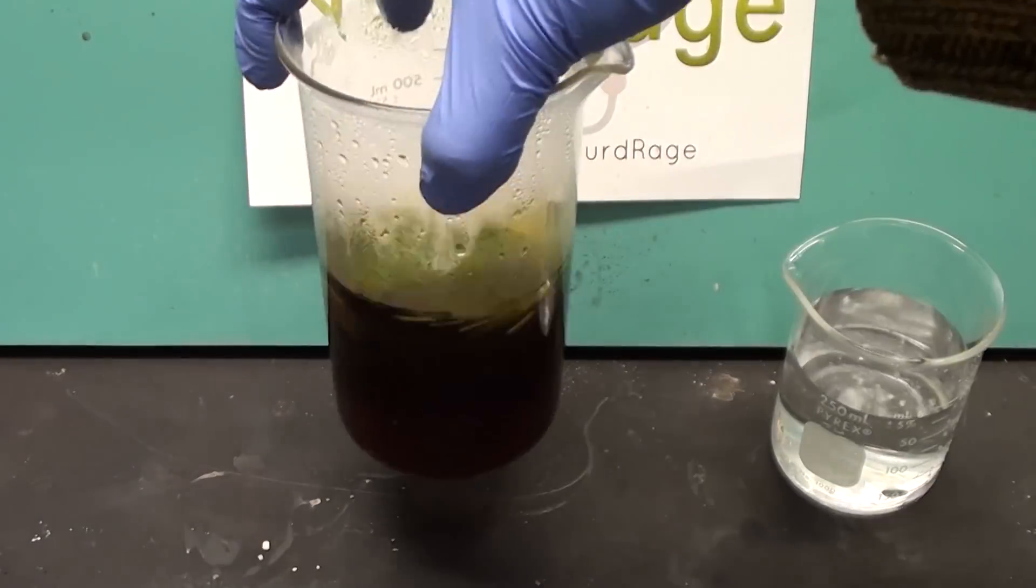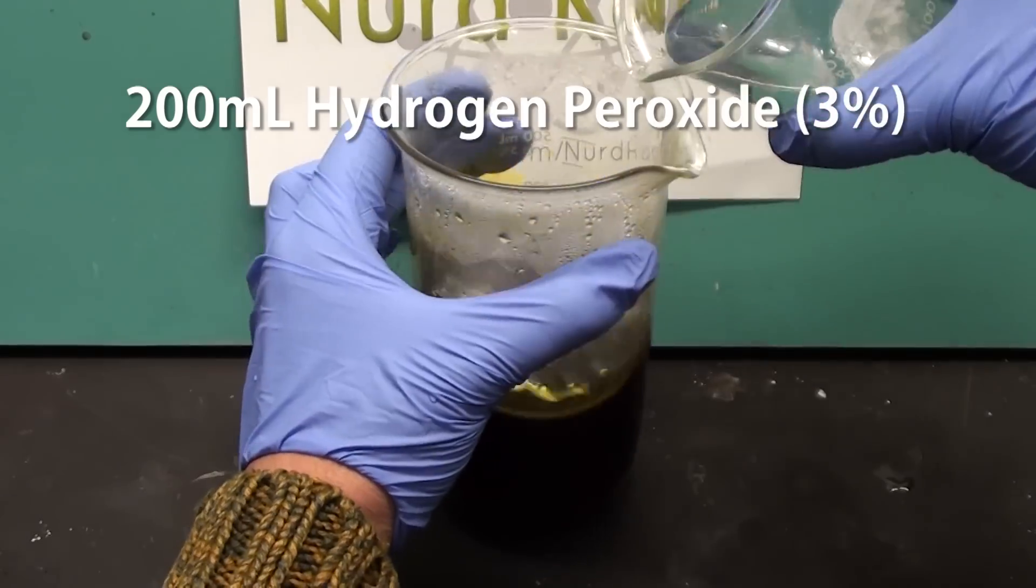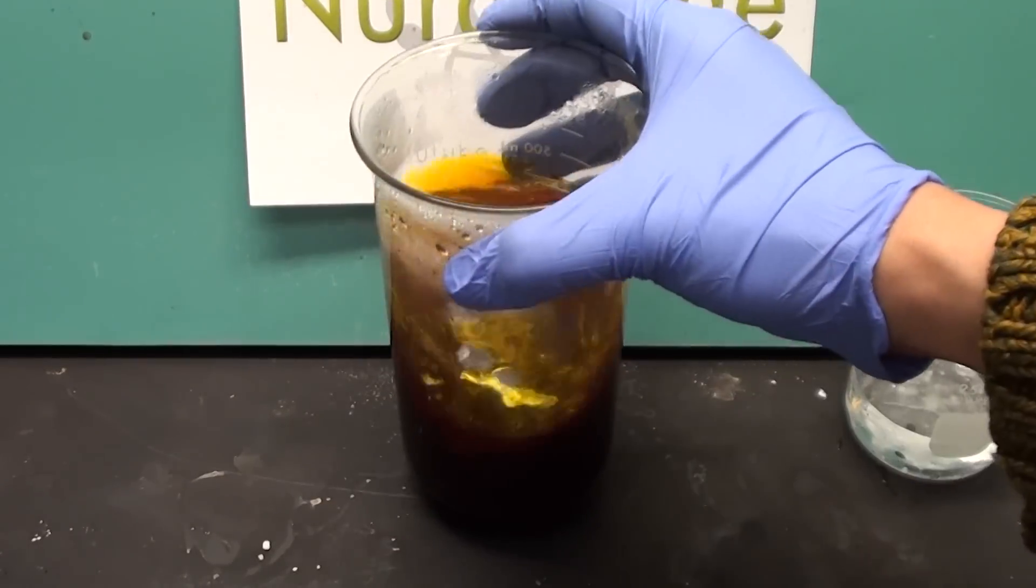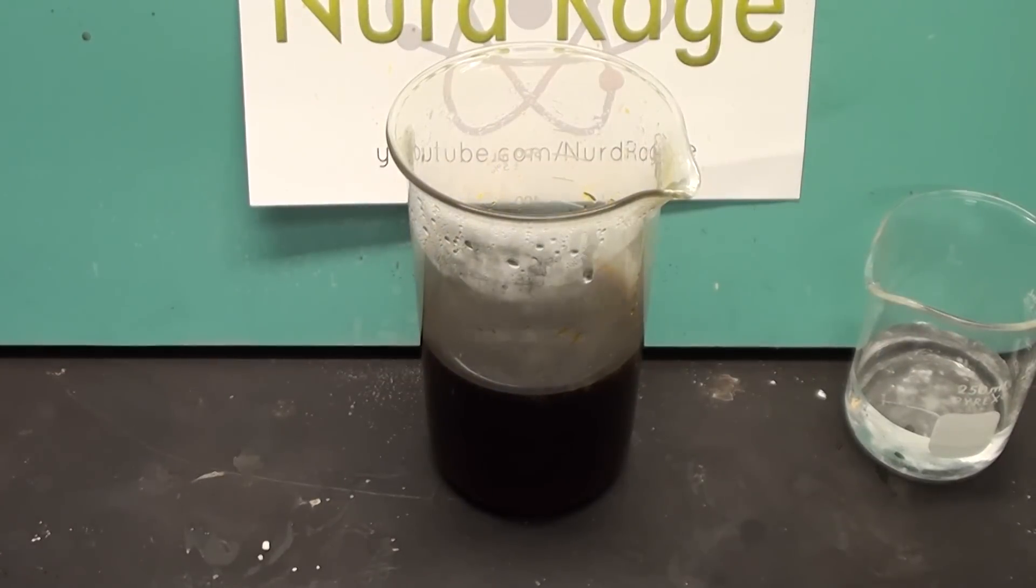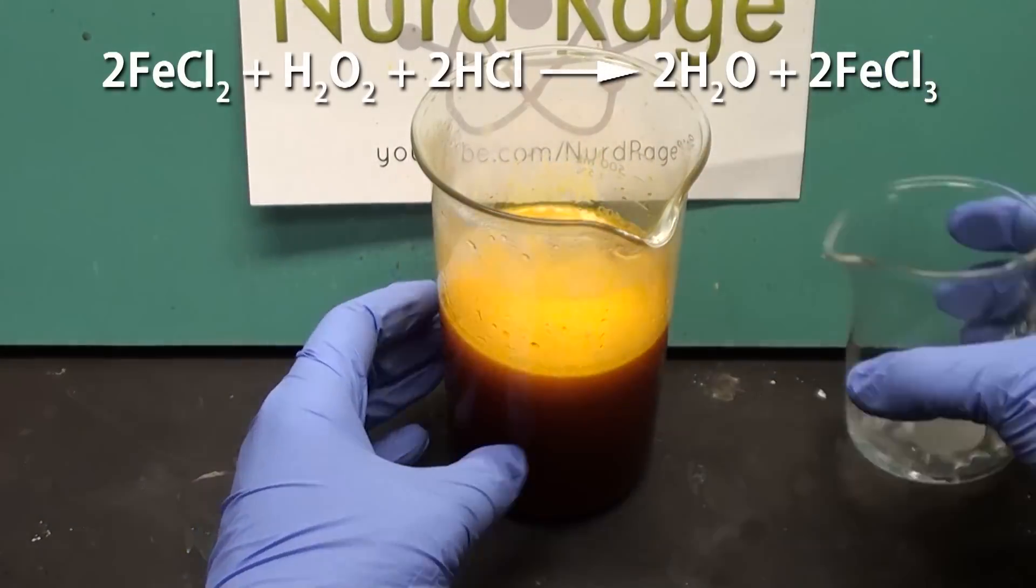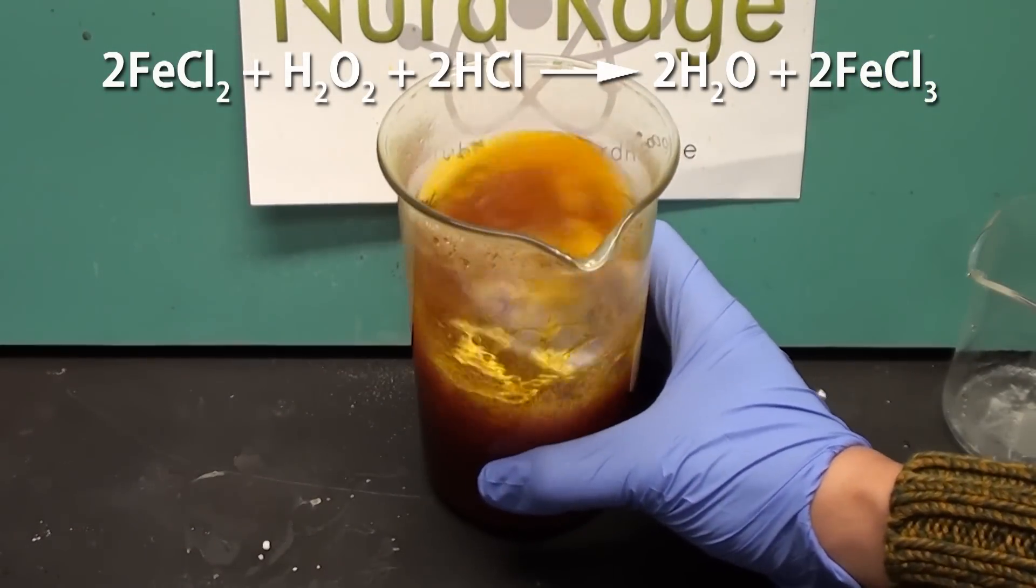Now with lots of stirring, slowly add 200mL of 3% hydrogen peroxide. Do this in small portions since the mixture will heat up a lot. If it gets too hot to hold, slow down and wait for it to cool before adding the rest. What we're doing here is oxidizing the ferrous chloride into ferric chloride.